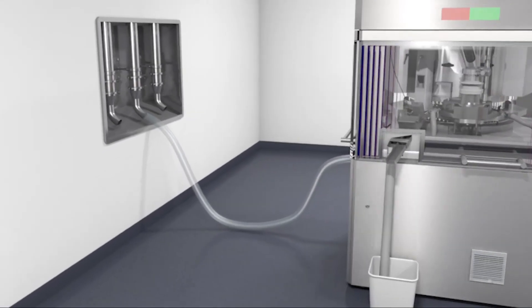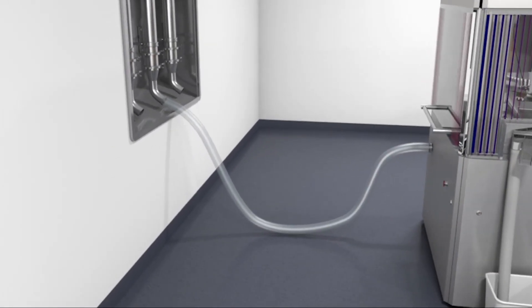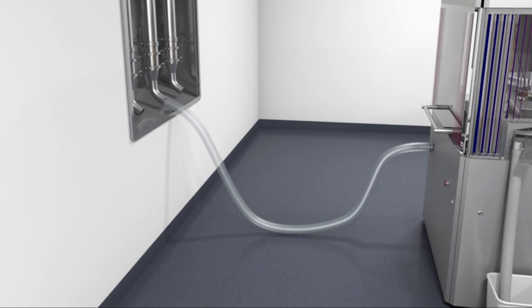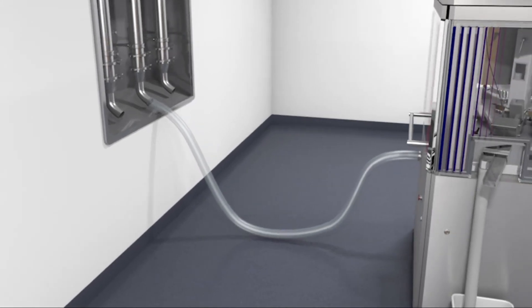This makes the loss of excess powder from compression and filling machines one of the most significant problems in powder processing.